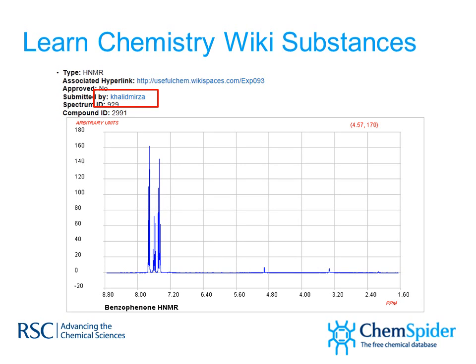And here you are going straight through from the Learn Chemistry Wiki out to ChemSpider, and we're showing you the spectra. This data was submitted by Khalid Mirza from Drexel University, so submitted by one of our users.